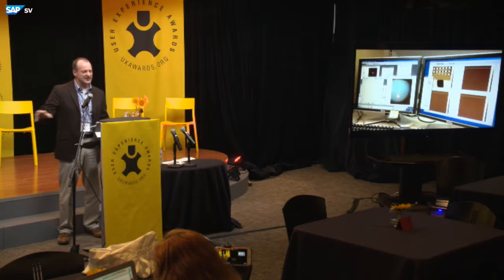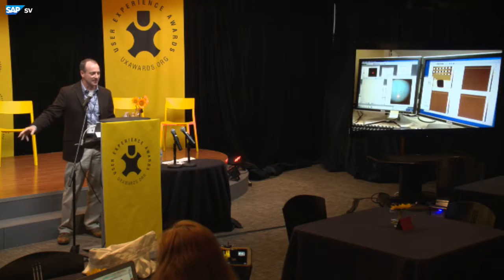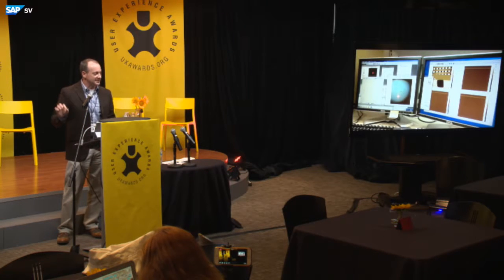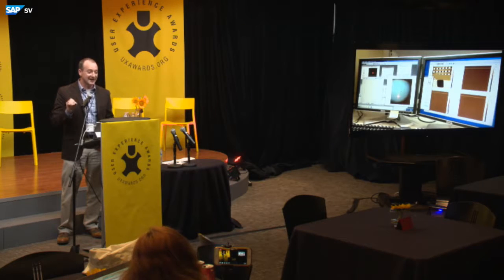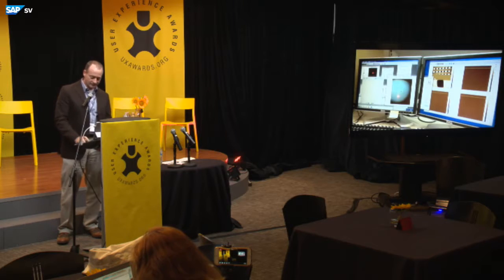Originally, the machine didn't come with a display, so people would set up 2 monitors and spread out stuff across 2 monitors. Stuff was buried behind things. It was impossible. And just to give you some sense, new novice users, think grad students, had a 0 success rate, 0%. No novice user could use this device ever.